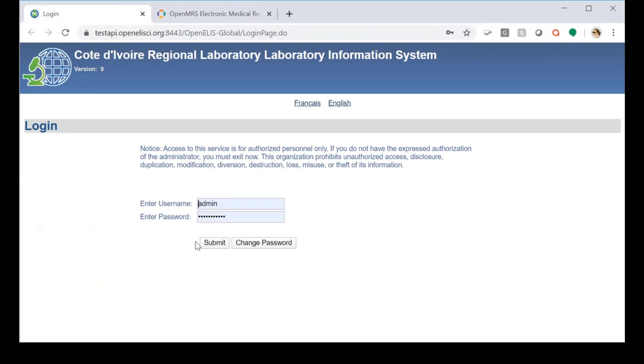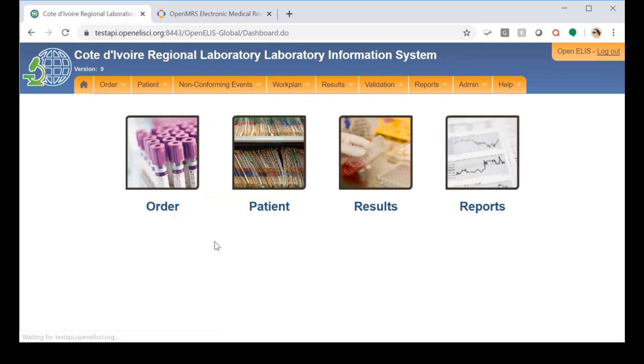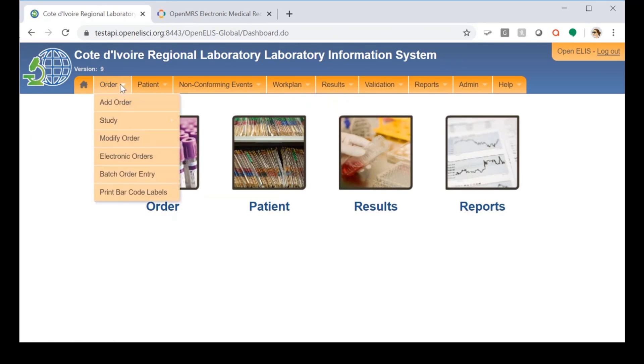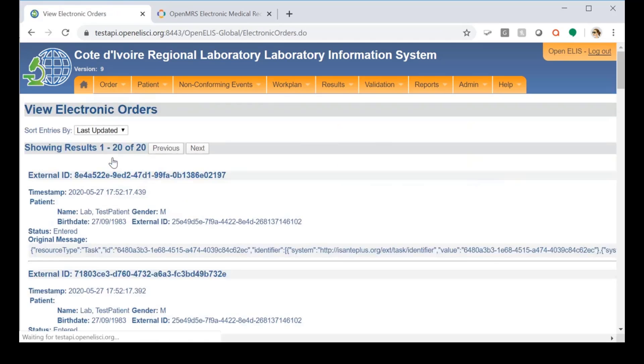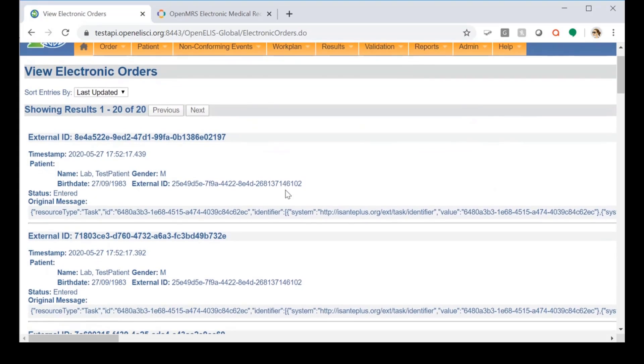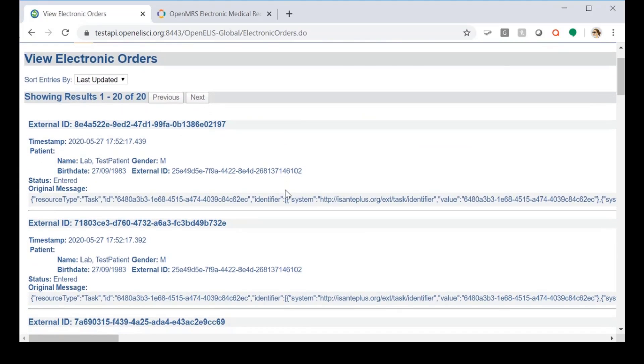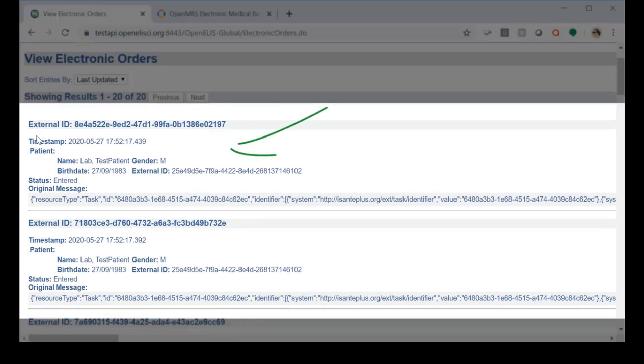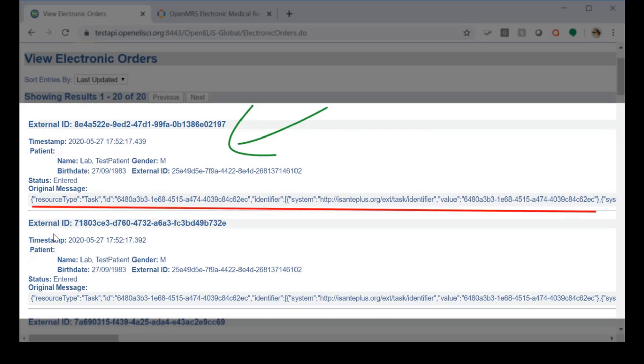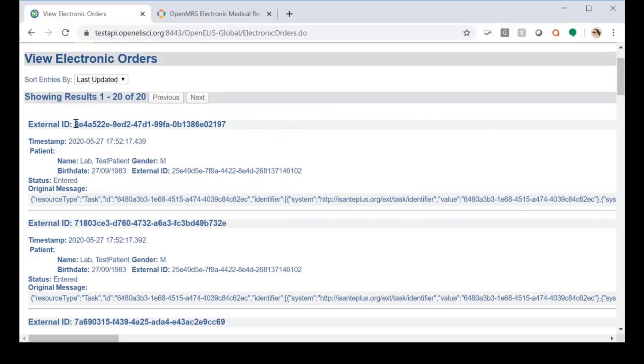So let's see if OpenELIS has pulled our order. We'll navigate to electronic orders and as you can see, the patient information and a copy of the actual resource is included.